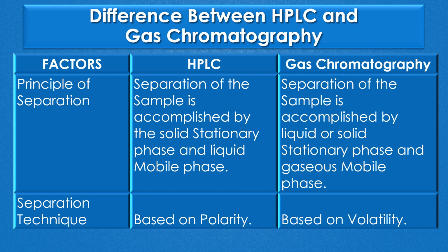Second, the separation technique of the HPLC is based on polarity, and the separation technique of gas chromatography is based on volatility.